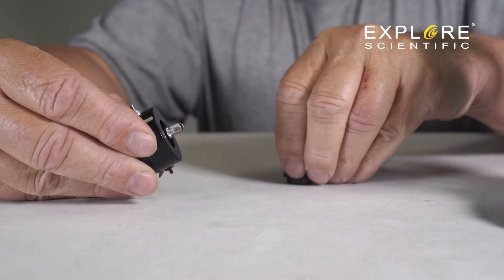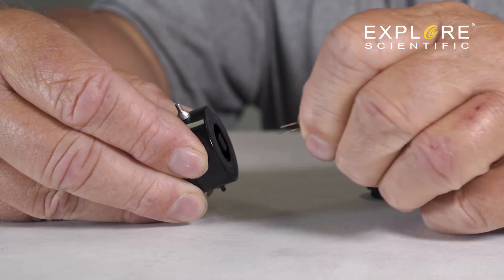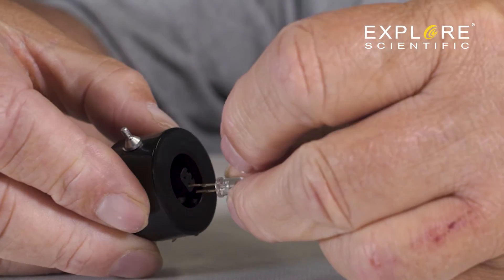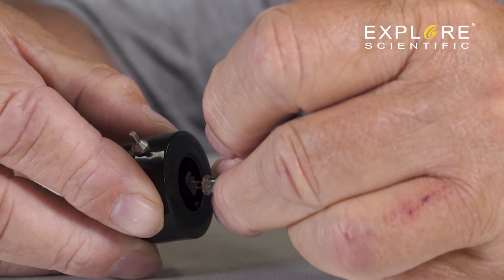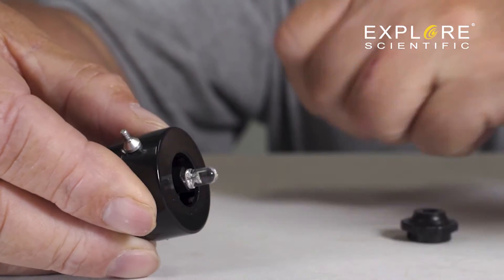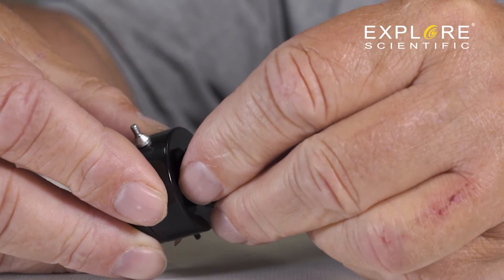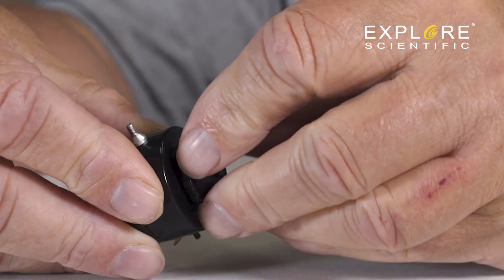To change the LED, remove the light assembly from the microscope. Remove the LED cover. Replace the LED. Then put the cover back in place. Once the LED cover is in place, put the assembly back in place.